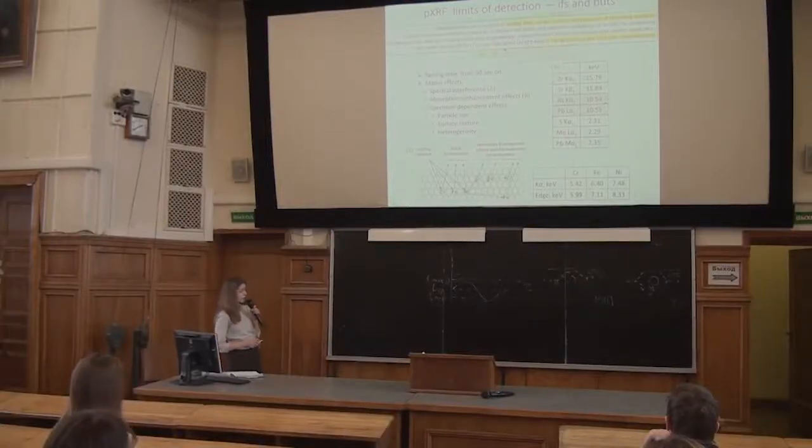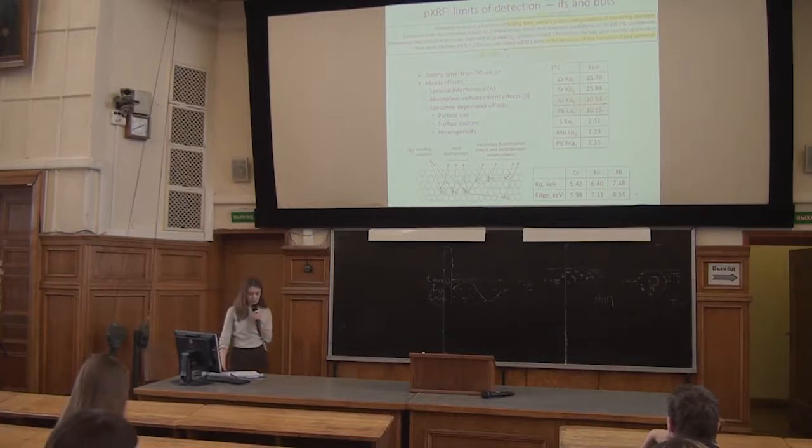As you can see in table A, some spectral lines have quite close energy values, which means detectors with a lower resolution will not distinguish between them. For example, in samples with a high concentration of galena and thereby high content of lead, spectrometers would show arsenic, even though there might not be any considerable amount of it. Absorption and enhancement effects arise from inner interaction of fluorescent radiation with the atoms of a sample before it reaches the detector. Therefore, spectral line intensity may be increased or reduced.